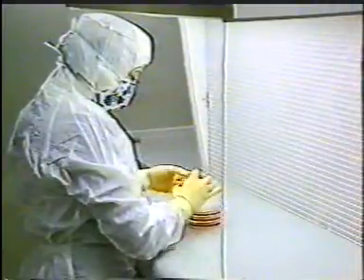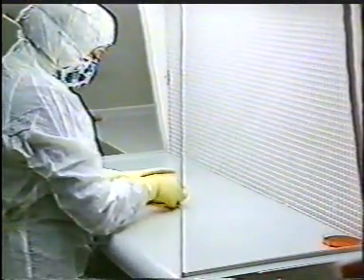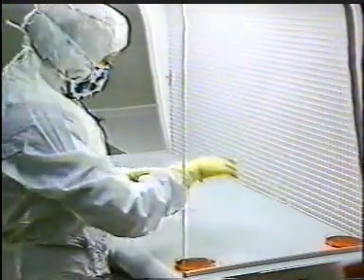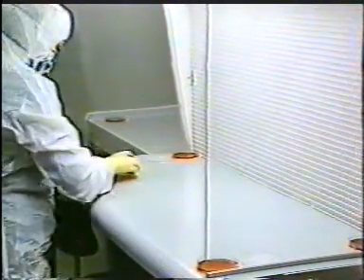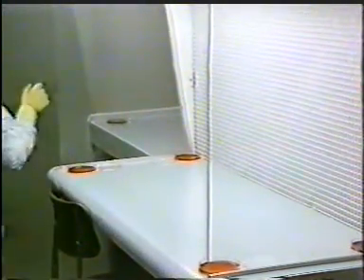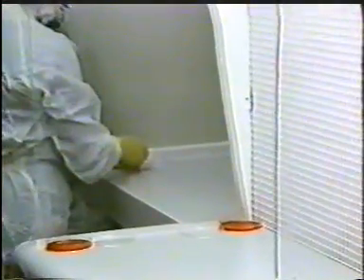The purpose of supplying manufacturing rooms with filtered air is to reduce the levels of both particulate matter and microorganisms. Levels of microbial contamination are monitored by the use of settle plates, which are exposed for a specific length of time in designated positions. The plates are numbered according to position and returned to quality control for incubation and examination.